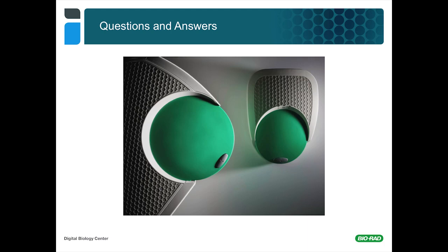I think when you're first starting, it's natural to want to do a couple of wells, a couple of duplicates, just to see that you're getting the same answer in each well. Ultimately, I think you can let go of those training wheels, and if your throughput demands it, go with a single replicate per sample.